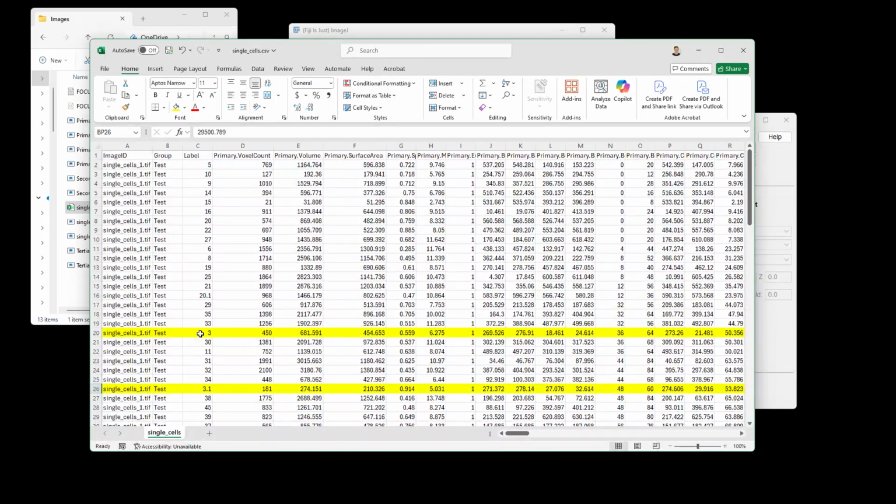This naming convention in the labels in single cell mode tells us that we have found multiple nuclei inside of the same cell. FOCUST appends an index to the number of nuclei that were found inside that cell. So in this case, there was a nucleus found inside of cell 3.